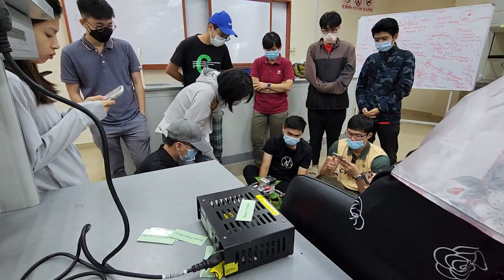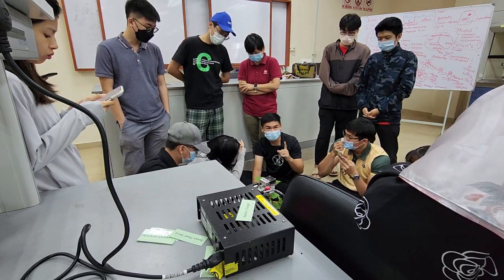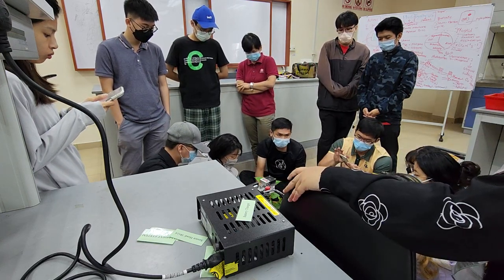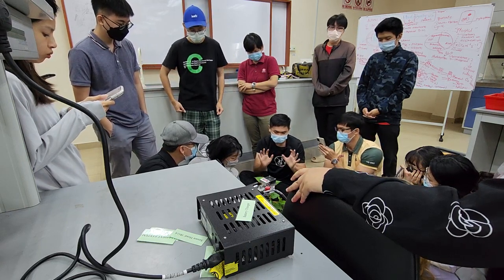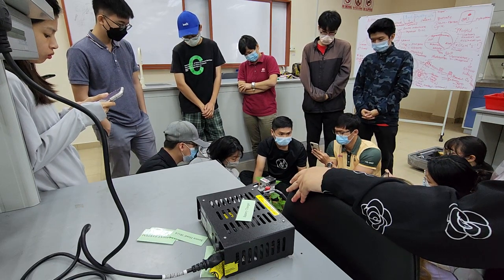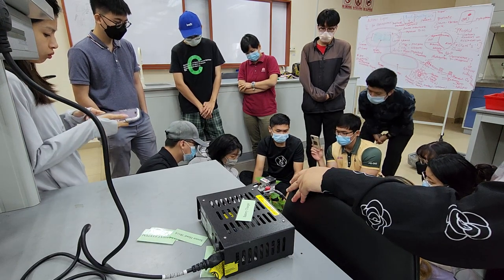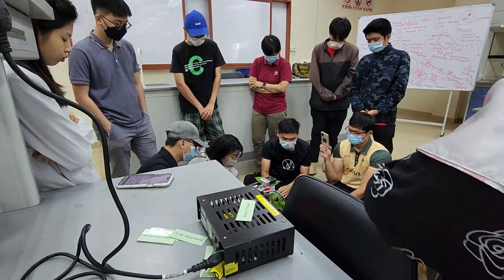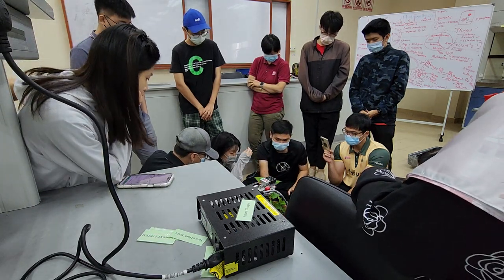Okay, so this is the hibiscus plant. So how do we choose the leaf? Every time we only measure one leaf, right? So how do we identify which leaf to take? The general rule of thumb is, first, you need to look at the leaf arrangement, which is the leaf phyllotaxy. What is the leaf arrangement here? Alternate, right? So first you need to ID the leaf arrangement.